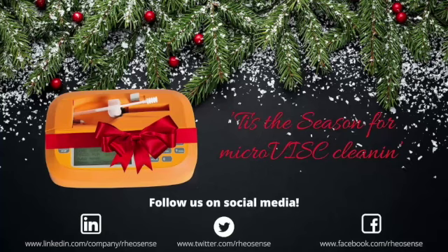How do you figure out what your ideal cleaning solvent is? How do you experiment and figure that out? So we do have dummy chips that we can sell as well. Essentially, it's just a flow channel on a slide, so you're able to see how well the cleaning is. You could also dispense a little solvent into a small amount of the solvent and see if it's miscible and compatible, that nothing forms, no particulates as well.